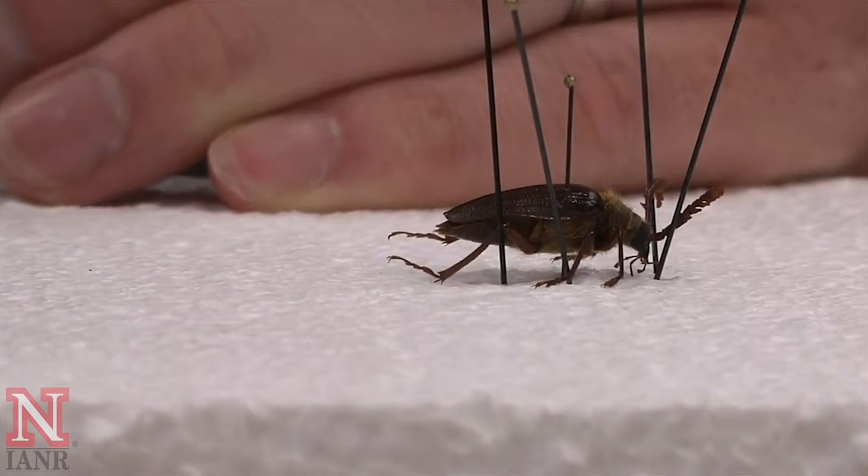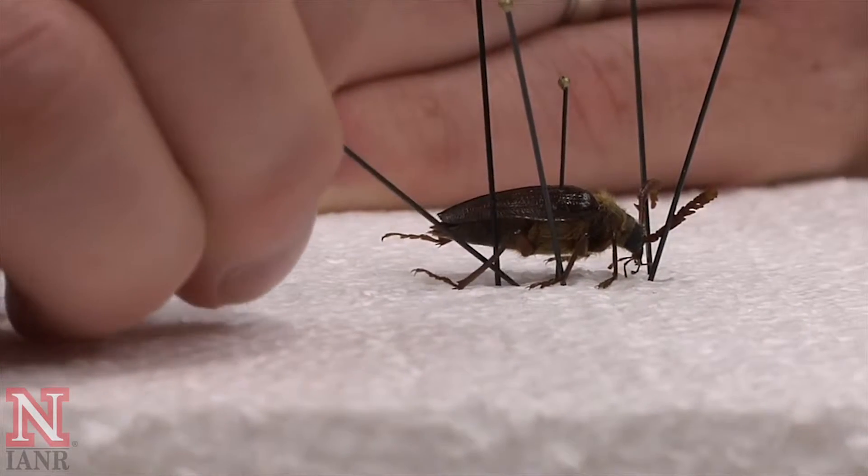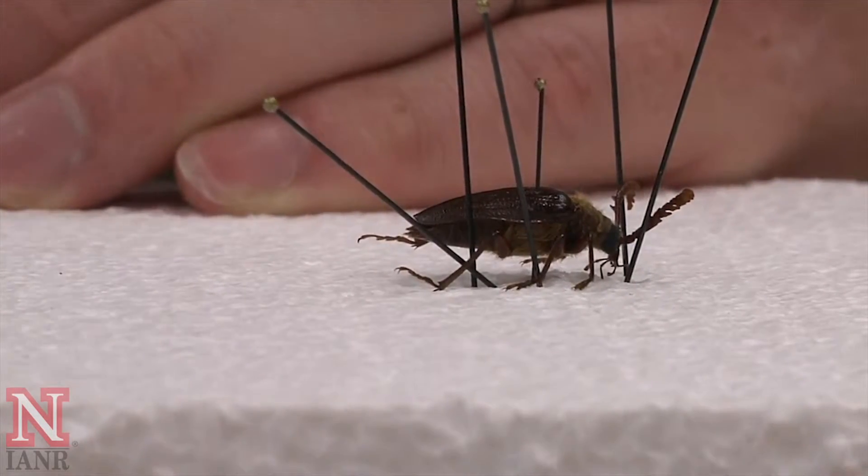Occasionally the specimen will rotate on you and you will need to use an additional pin to hold it in place while you work on the legs.